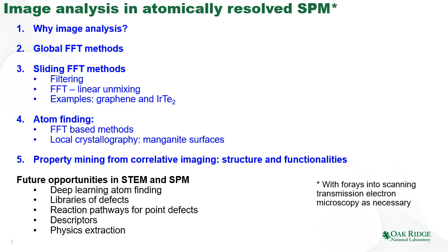This lecture is going to be based on largely historic material going back about 10 years. So stay tuned for the future opportunities in STEM and SPM, where we will talk about deep learning for atomic finding, defect libraries, extraction of reaction pathways, structural descriptors, and learning physics from the microscopy data. However, the topics discussed in this lecture provide the background on which these more advanced applications are built.